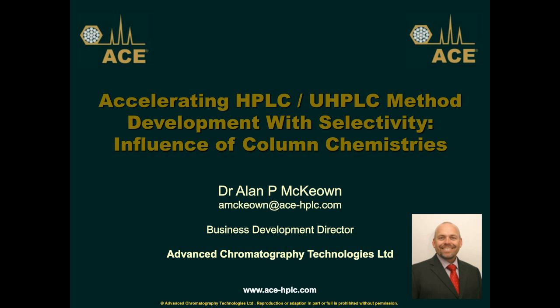So today's topic is all around HPLC and UHPLC method development and how we can speed up those method development activities using the power of selectivity. Selectivity being a key concept in chromatography. The focus of the talk today will be about how we can use different types of column chemistries to help us in our quest for rapid method development.